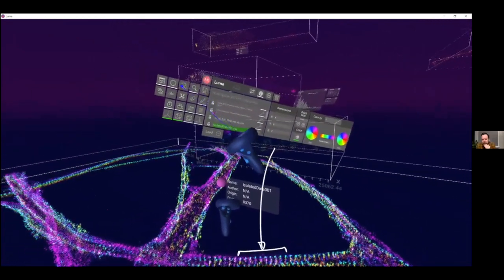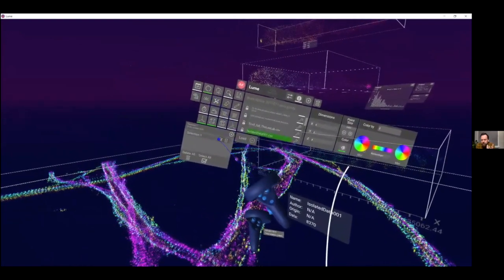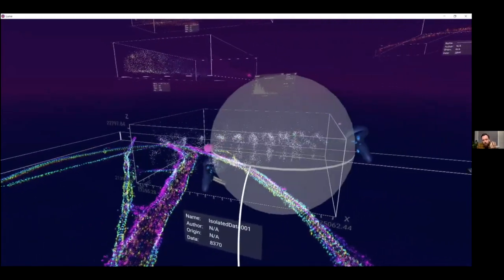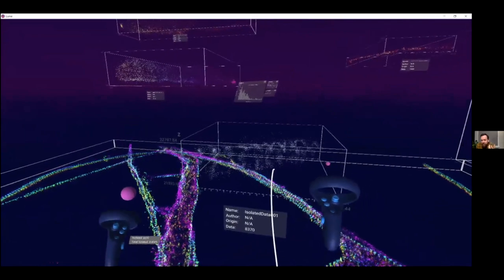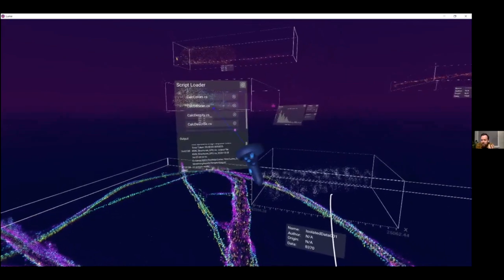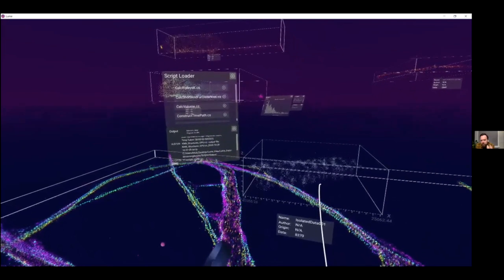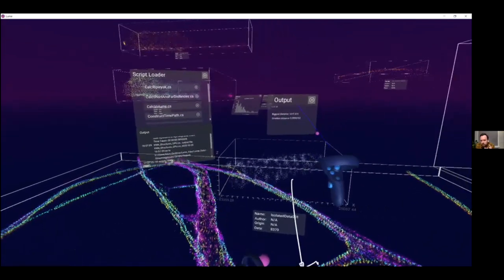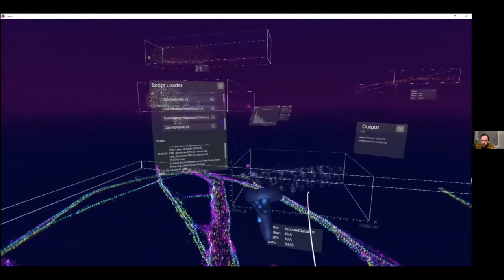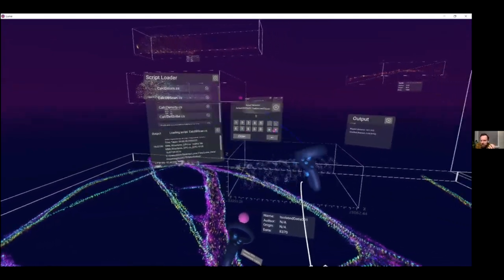Yeah, maybe I could just give a bit of a scientist perspective here. We generate these data, and actually the output of a super-resolution microscope is not a picture, as you might think of a standard microscope. What it actually outputs is a text file, a list of the spatial position of individual fluorophores. And then what the software is doing here is rendering the positions of those fluorophores for you to be able to, in your brain, interpret that as a three-dimensional image. Now, you might just say, okay, well, you could just plot that. It's just a three-dimensional plot is what it is.